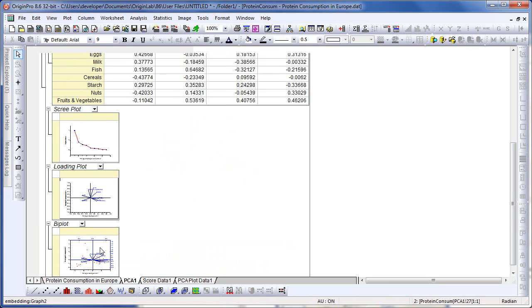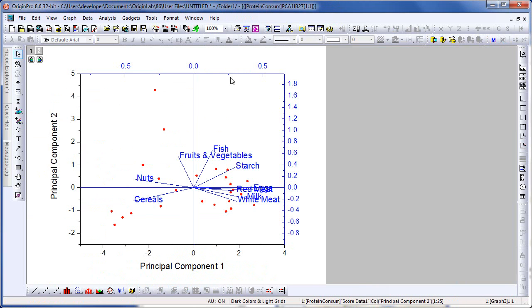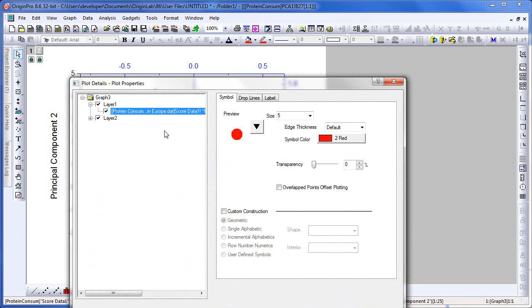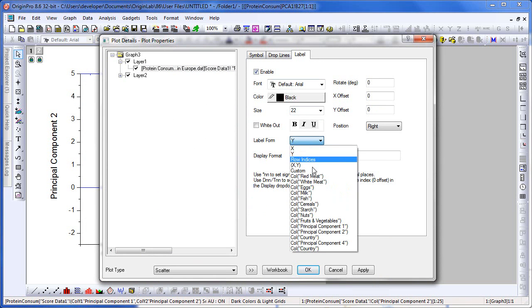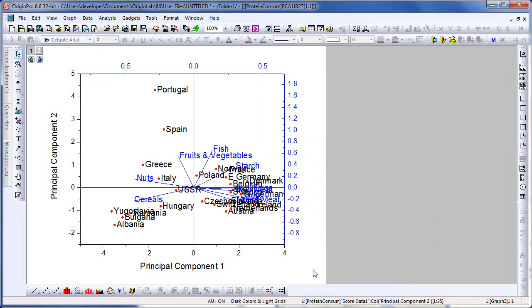Let's scroll down and open up the bi-plot. This plot displays both the loadings and the scores for the two selected components. All 25 rows in the raw data, each representing a country, are plotted as a scatter plot — these red points here. If we double click on these, we're brought into the Plot Details dialog, where I can add a label for each point. Let's turn on the label and choose the label from the country column. Now we have each point labeled.